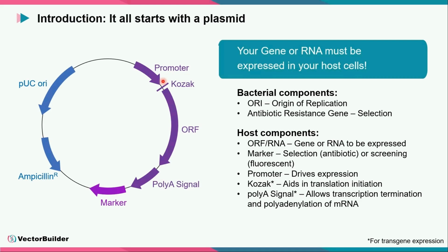So now we have our plasmid. It's ready to go. If we can get this plasmid right here into a cell, it will function. Yay. But I mentioned before that there are a variety of modes of transport for our little gene of interest or RNA of interest right here, including viral vectors.